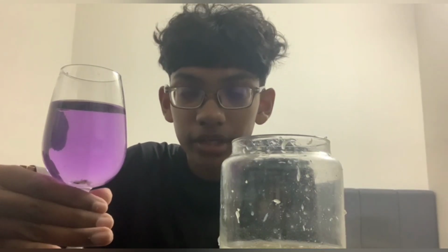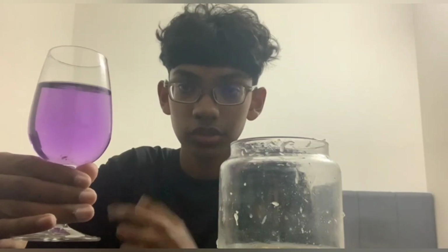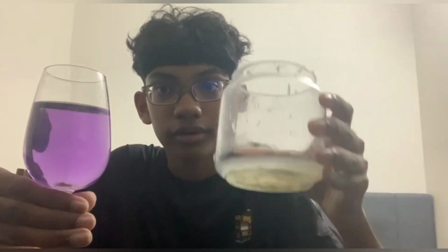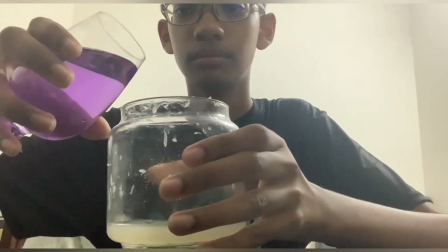Alright, so now I'm going to try my acid base or pH indicator, which is my red cabbage solution, and test it out on this lime juice right here. So let me just pour it in.